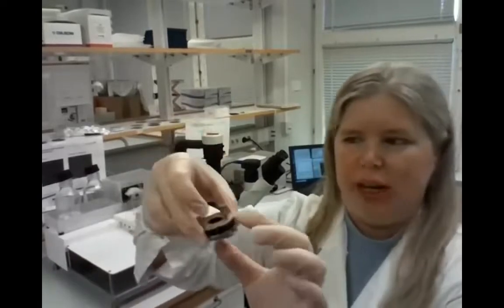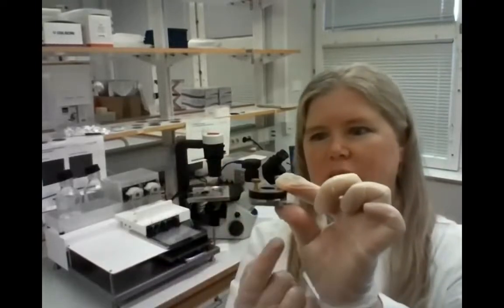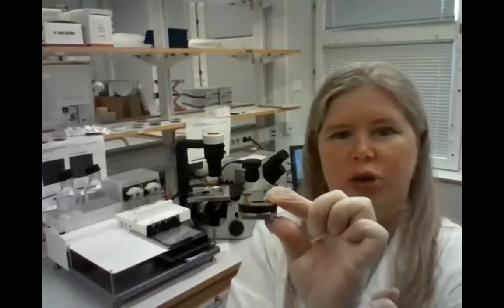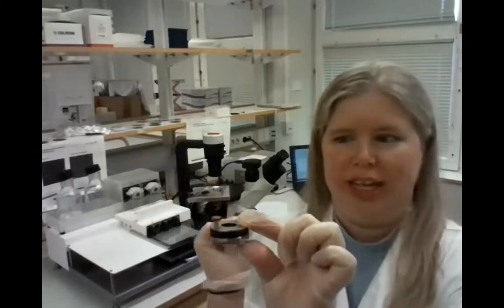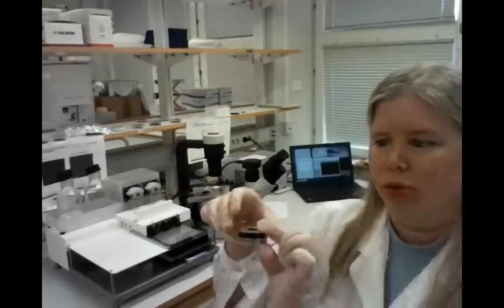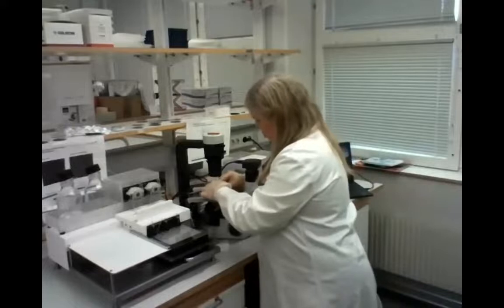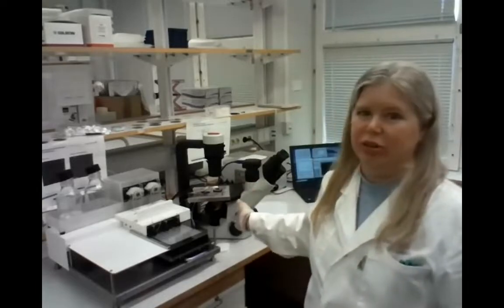But when I put it in place, you still will not have contact in between the particles and the mucus implant, because you have a slope here in this dissolution chamber holder, and that slope will make it possible, due to the construction of the dissolution assay, that the particles are not in contact with the mucus implant until we start the experiment from the computer. So now I will put it in place here. So here it is now put in place, but the experiment is still not started.